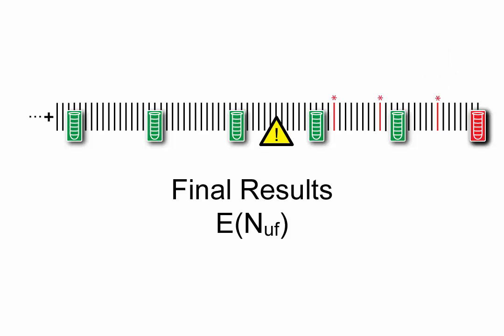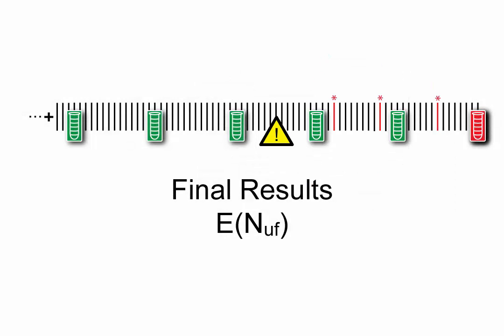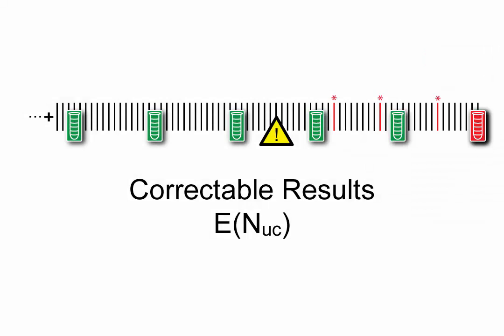Results produced prior to the last accepted QC are unlikely to ever be changed and can be considered final. In this example, there are 2 final unreliable results. The last video covered this concept. The patient results produced since the last accepted QC are the most recent and should be corrected if there is a problem. In this example, there is 1 unreliable correctable result.